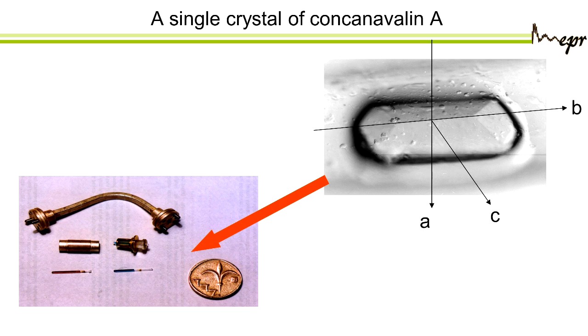And this is the size of the waveguide. I told you that you have to connect all these waveguides. So if anybody saw an X-band waveguide, it's this big, and these are very small. So here's a little bit of instrumentation.